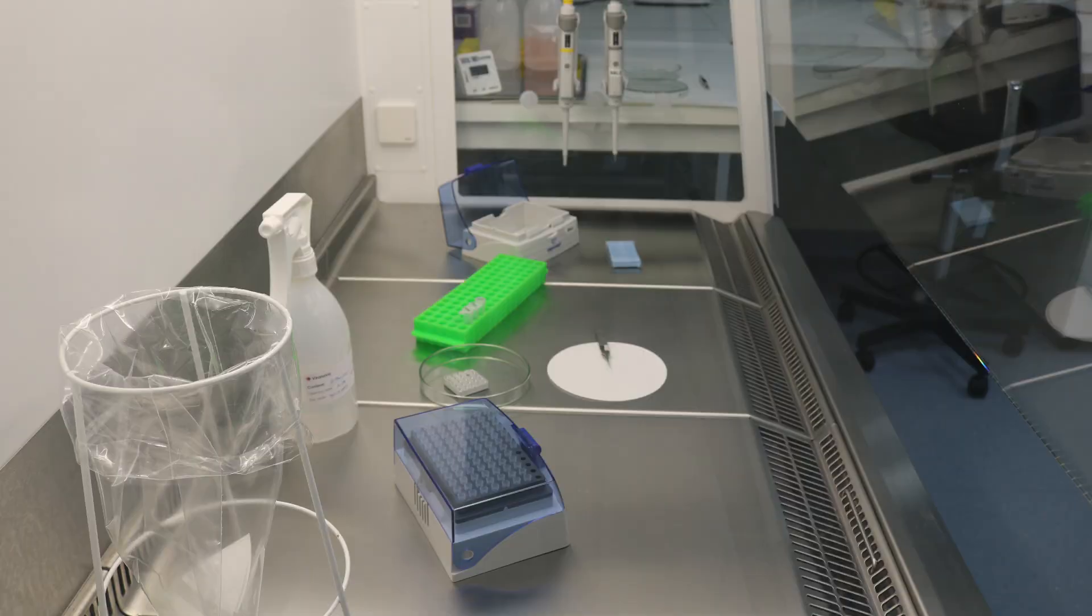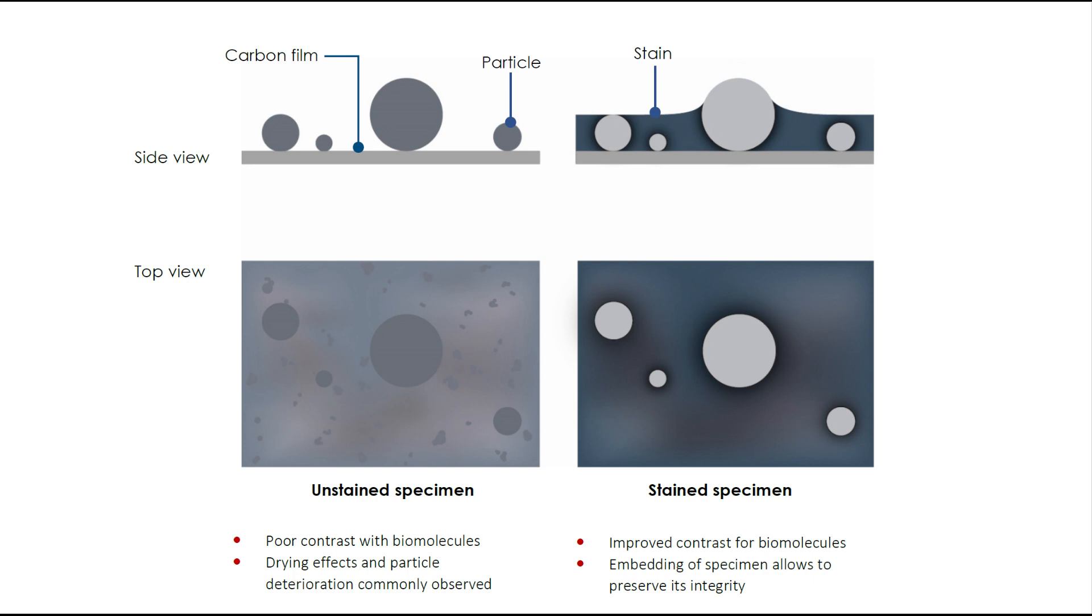This video shows how to correctly perform sample preparation in a biosafety cabinet with negative staining for grids to use in the MINI-TEM system. Sample preparation is straightforward.